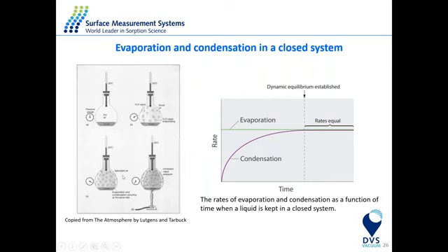Okay, so this is how we're going to measure it. At some point, we will saturate, because it's a closed system, so we're going to measure the saturation pressure of water inside this system. So now, how are we going to do this experimentally?